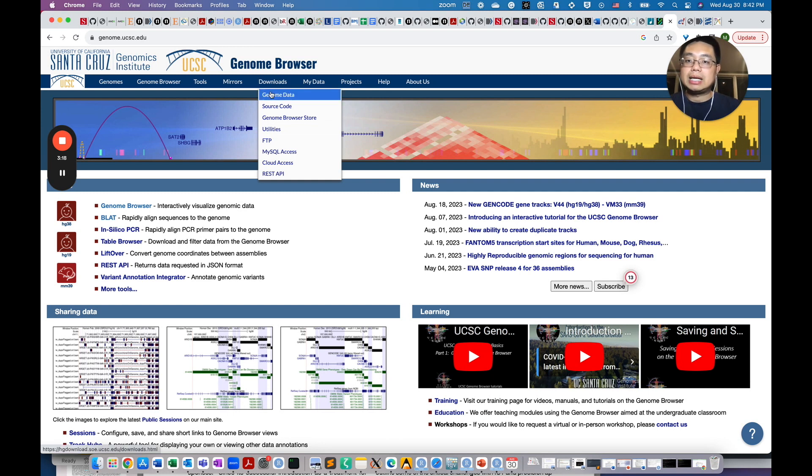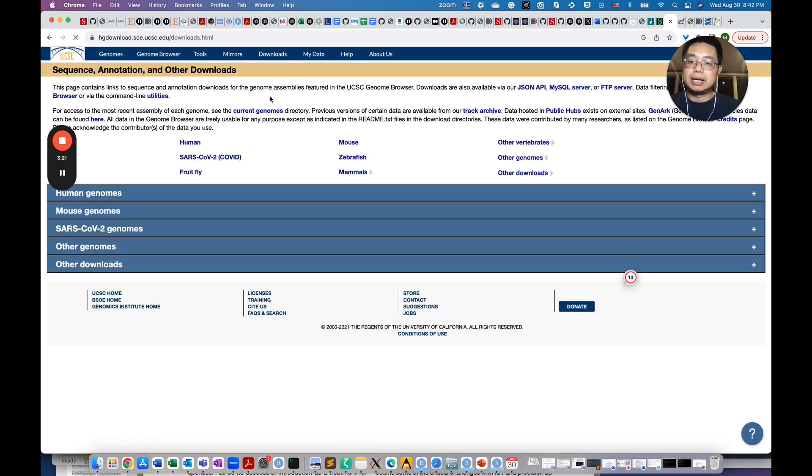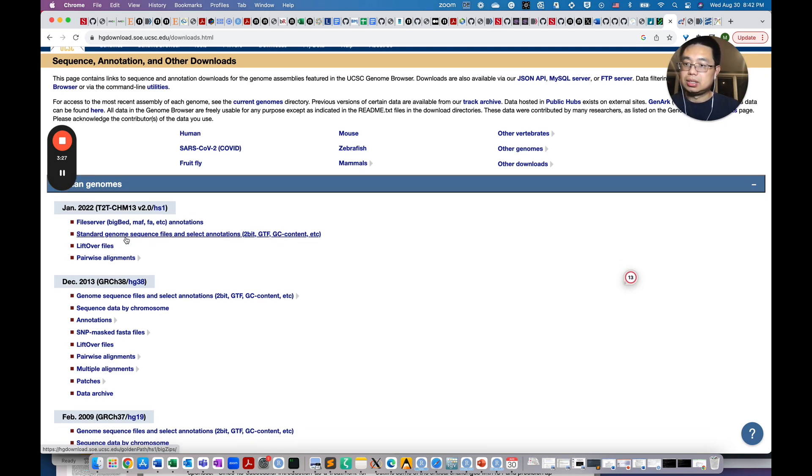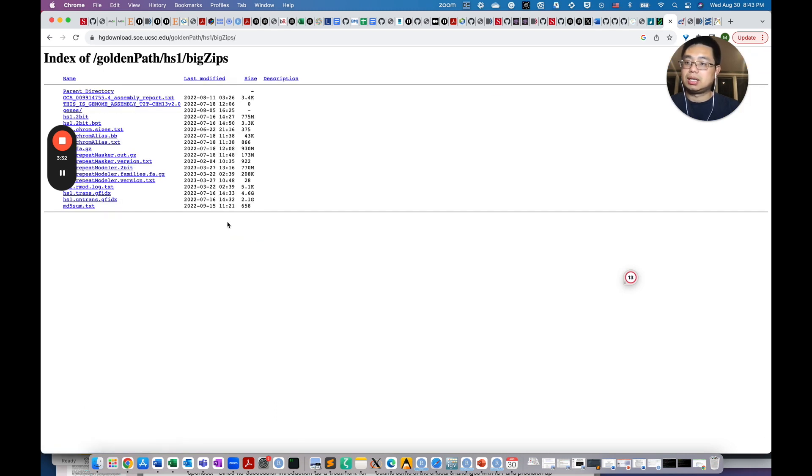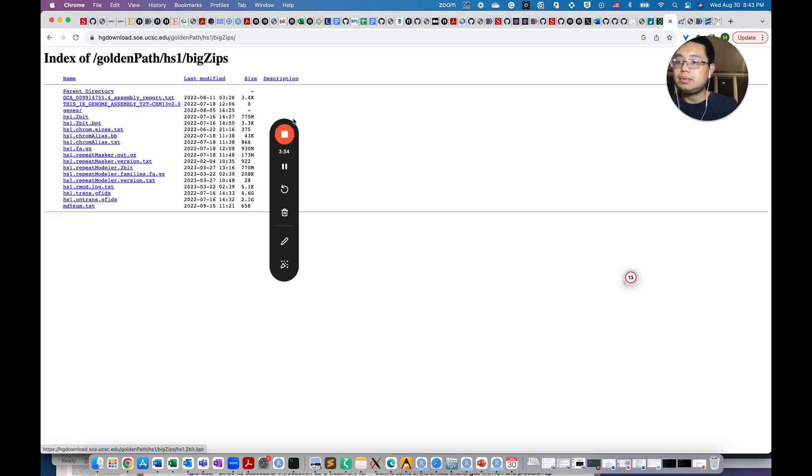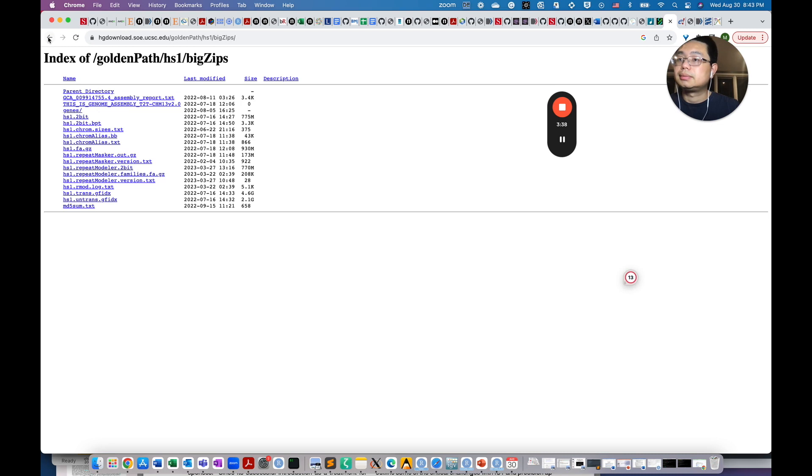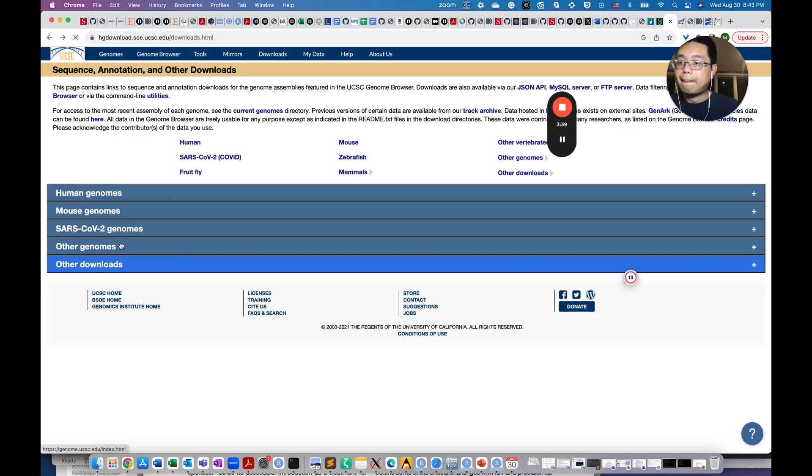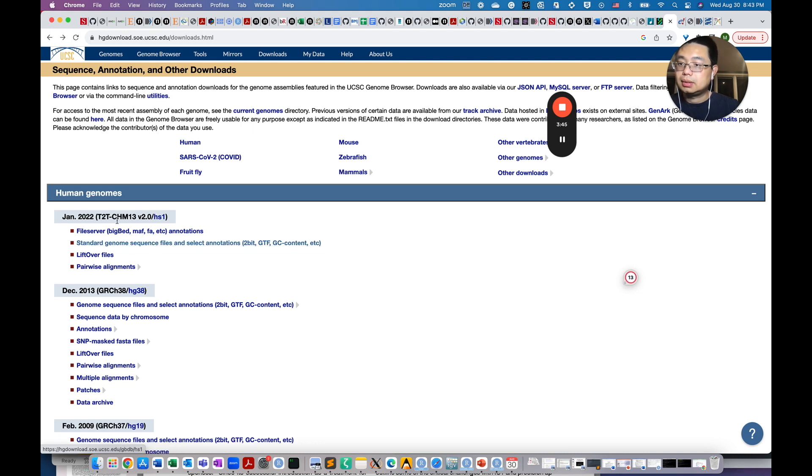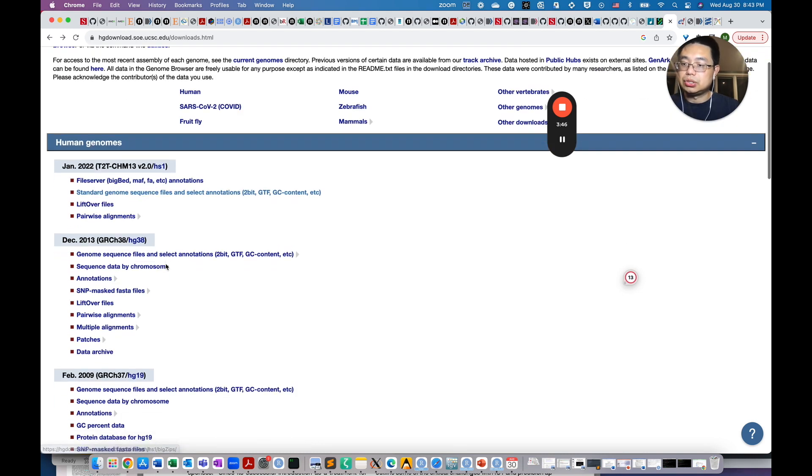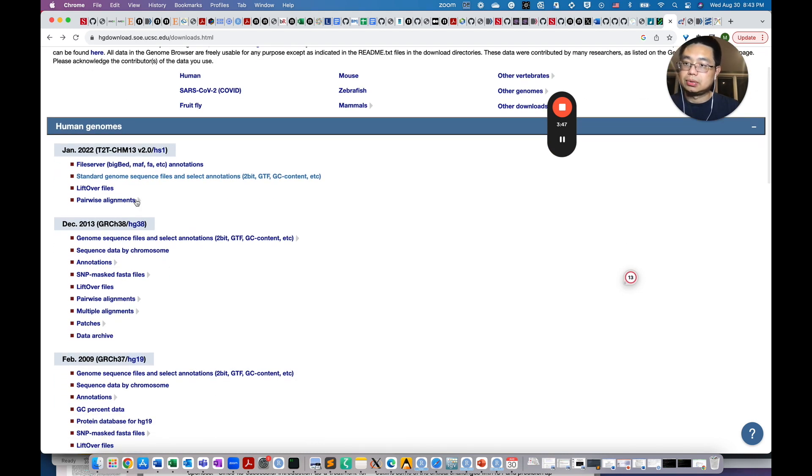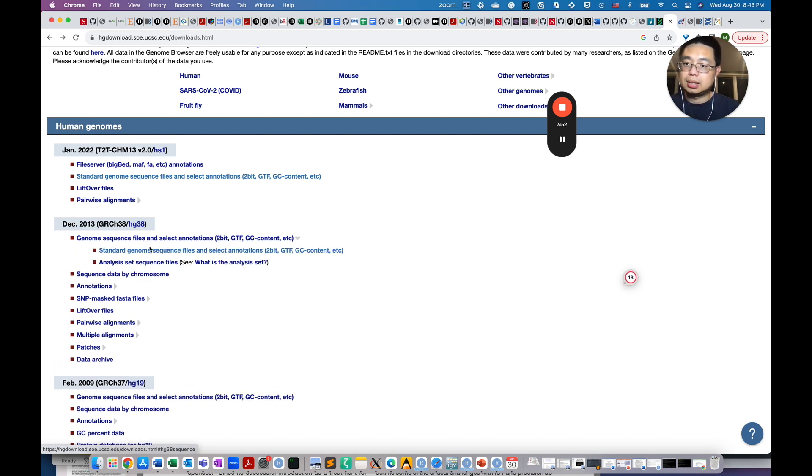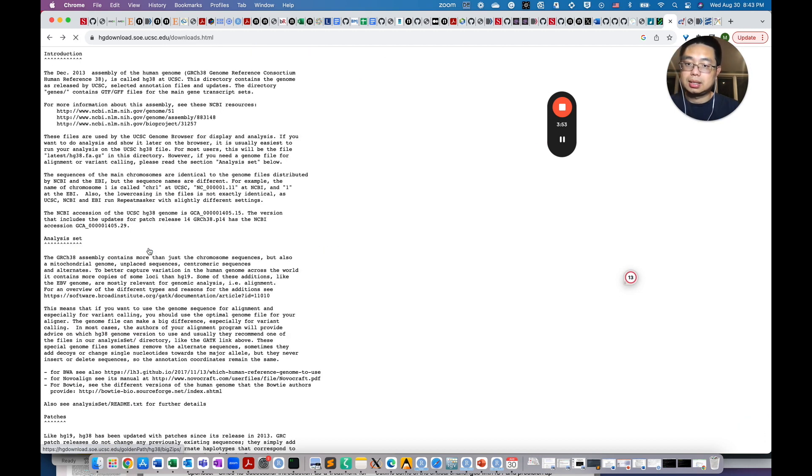To download those data, you come here, Genome Data. If you want, just take human genome as an example. So you can click here and you see the standard genome sequence files and the annotation files for the GTF files here. So if you click here, this is T2T genome. So let's go to the HG38 genome. So click here and click here.